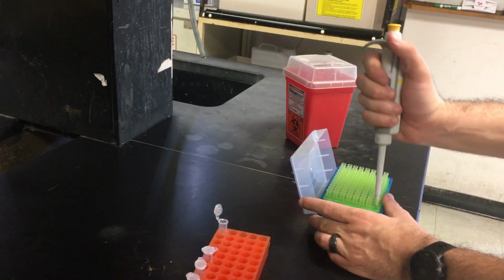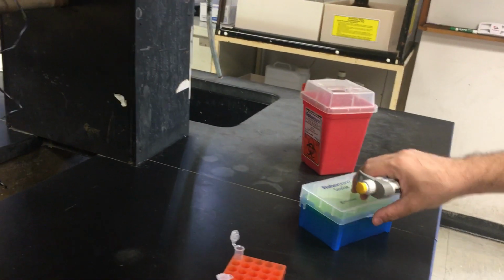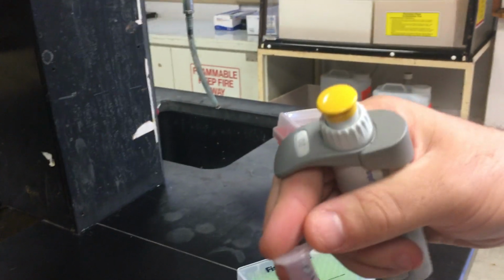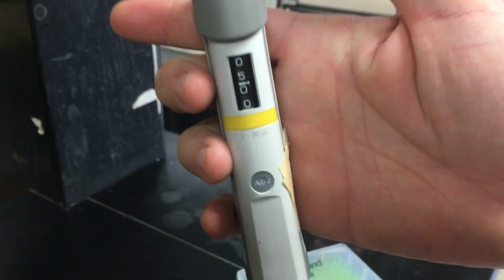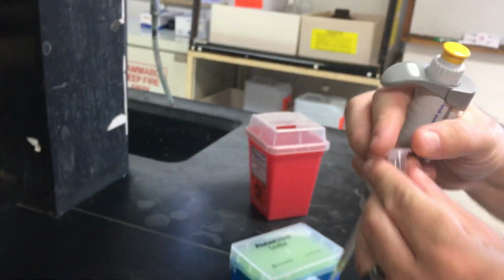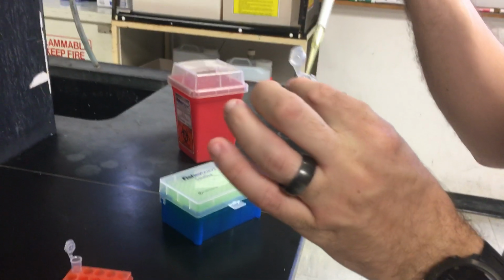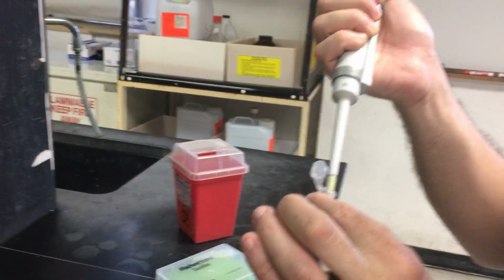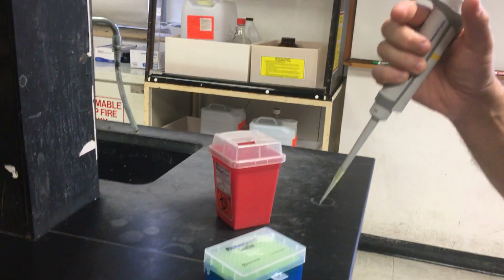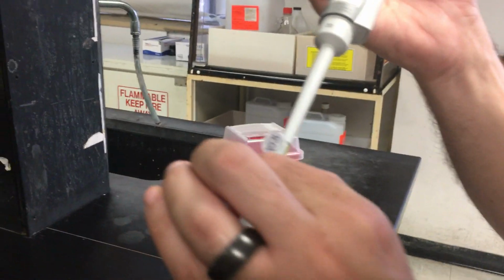Next, we're going to add our restriction enzyme, PstI. The same 5 microliters. Show the pipette here. The 5 microliters. Can you see? The maximum volume is 20, so we have 5. When you pipette, you push not all the way down, your yellow button on the top. So we're going to add that. There you are. And we're going to gently pipette up and down to mix.